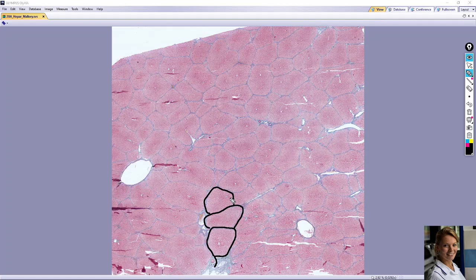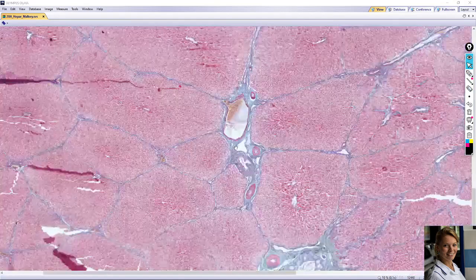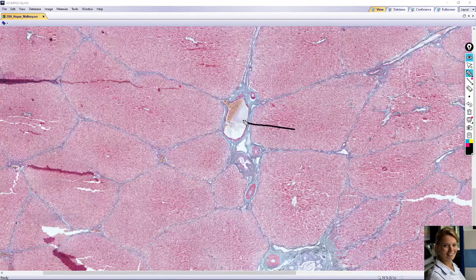For better visualization of the interlobular septa, we use porcine liver and a special staining method where the interlobular septa are blue. The interlobular septa contain interlobular branches of the portal vein. It's here. Yellow erythrocytes are also still visible inside the portal vein.